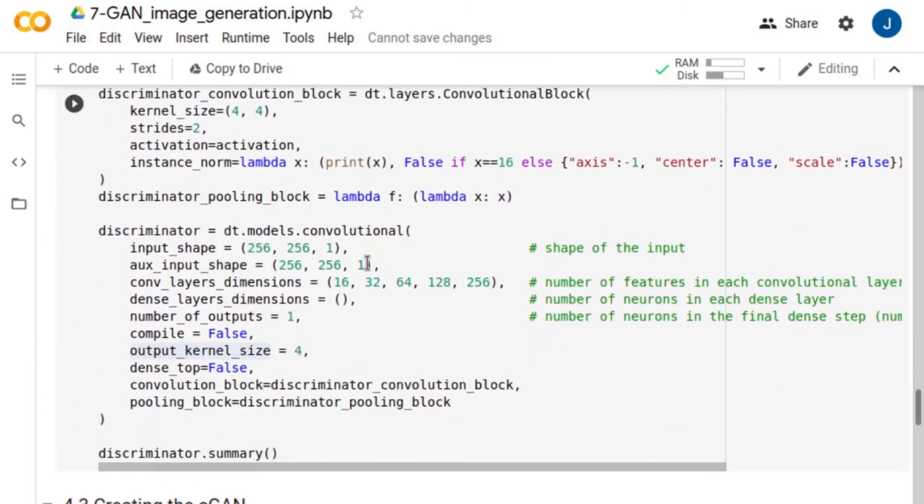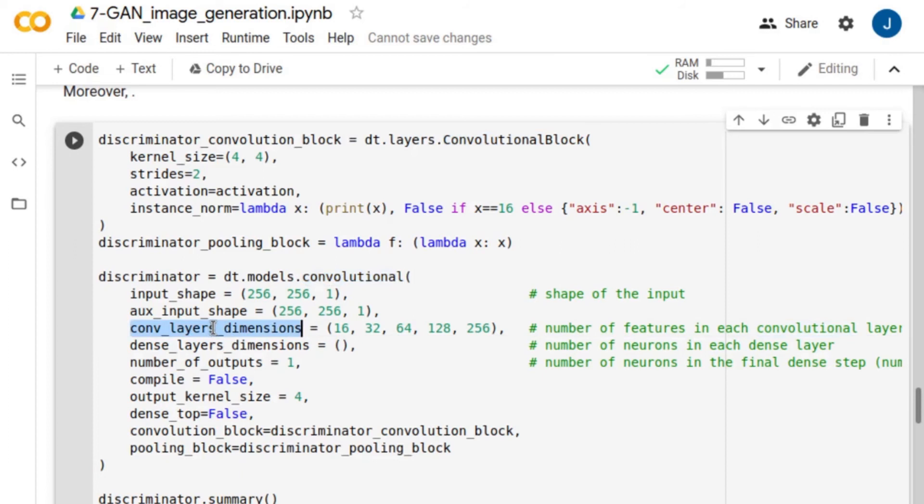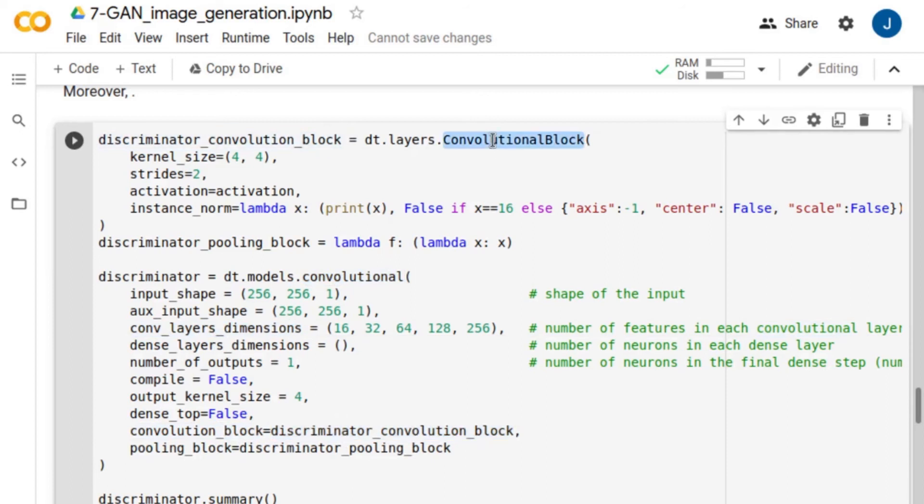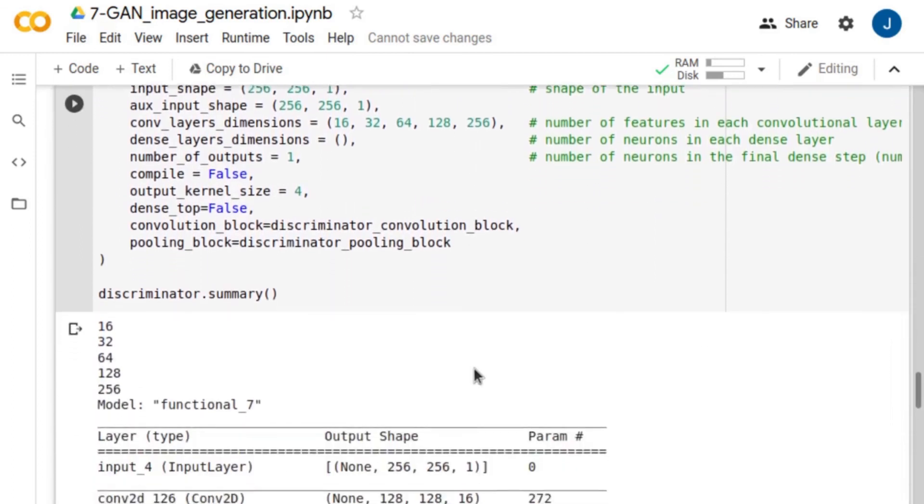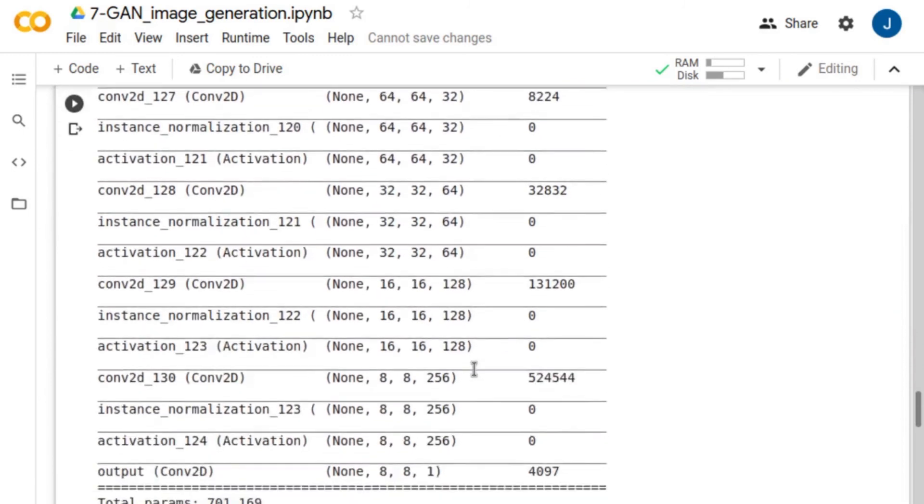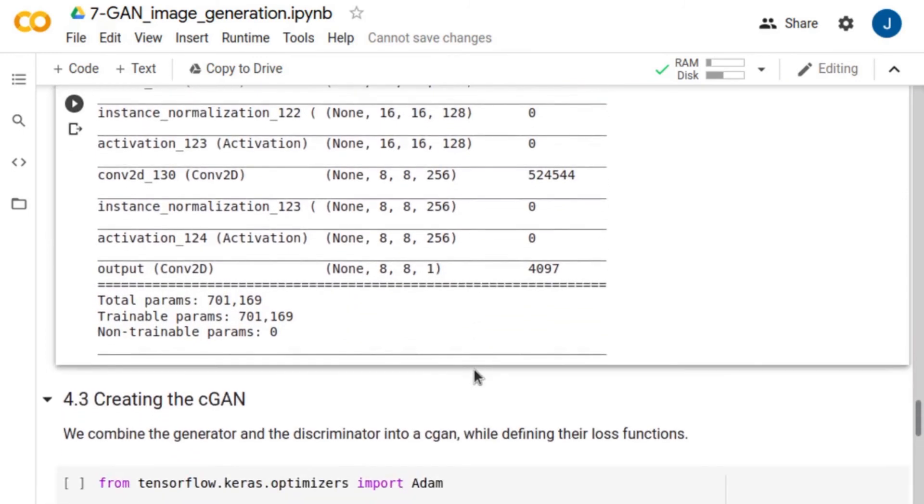The discriminator is a convolutional module. As previously, we define the number of filters in each convolutional layer of the down-sampling path. For this module, we also use convolution blocks with a stride of 2 for down-sampling. Note that dense is set to false. We do not want to have fully connected dense layers at the end of the network. Instead, we designed the discriminator to divide the input images into overlapping patches and classify each patch as real or fake rather than using a single number to describe the image.